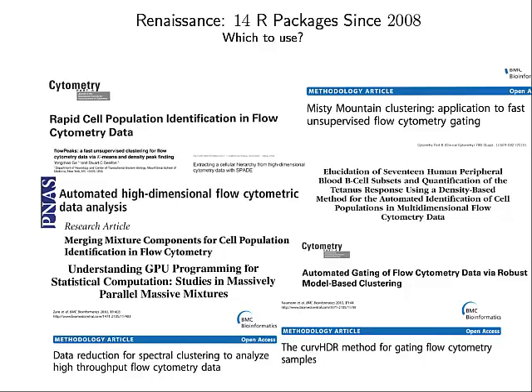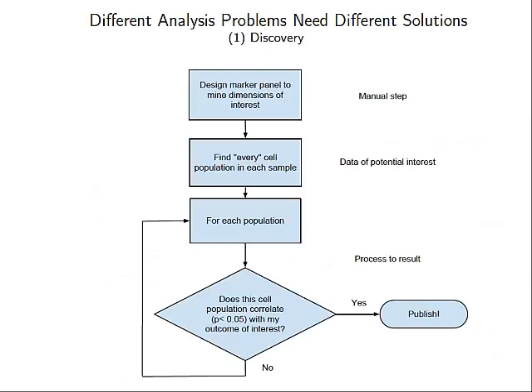And I think there's a lot of hope in the future. There's going to be a lot more stuff in R as a result. And basically because, like you've seen today, it leverages that whole infrastructure. So if you're developing a clustering method and you want people to use it, you don't have to write all the extra code that does everything else that you guys have been working on up till now to get people to use the code. That's seriously a lot of effort, just to get an FCS file into a program and manipulate it. The people doing the clustering algorithms don't want to have to write all that stuff again, so they can tap into the stuff that we have. And it's a statistical programming language, so it leverages all the tools that are in there. It just makes sense.